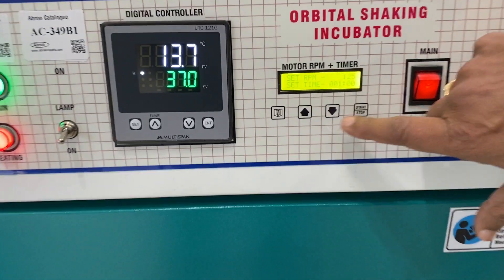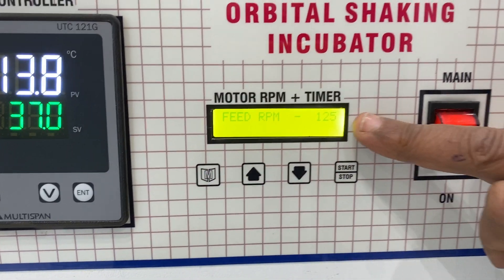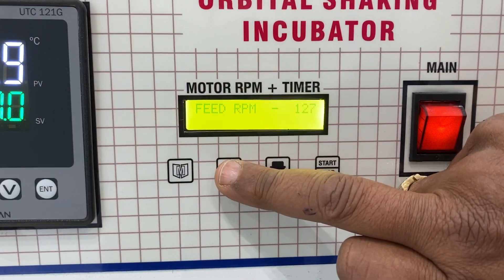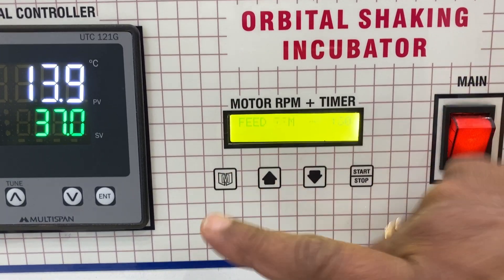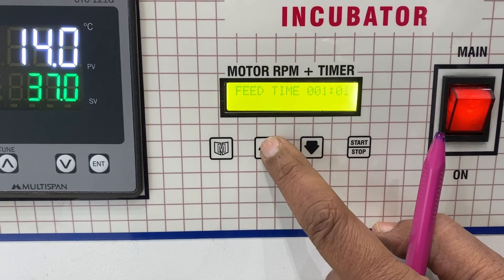Now I'll tell you how to set the speed of the rotor. This one is for setting temperature first. Now this tells you speed feed RPM. I can increase it — I am now putting it on 130 RPM.